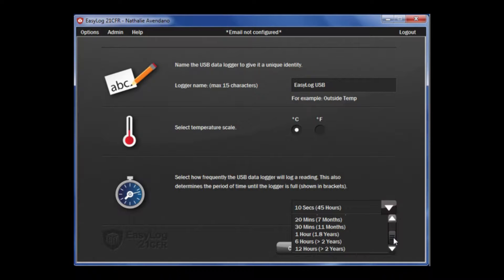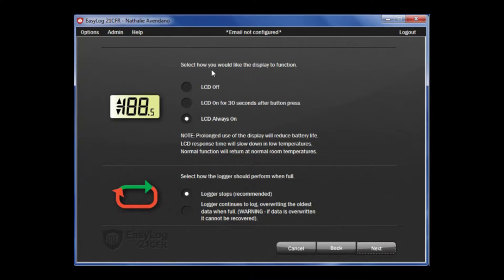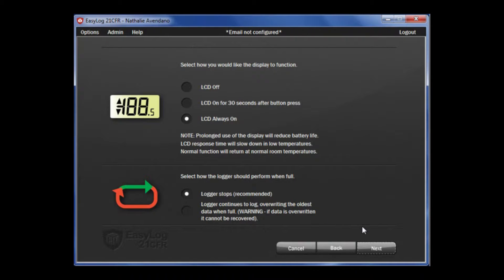Once that is complete, click Next. On this page, you have a few options on the LCD. You can either have it off, on for 30 seconds after button press, or on at all times. Next, you can choose if you want the data logger to stop when it's full or whether you want it to roll over and continue to take readings.